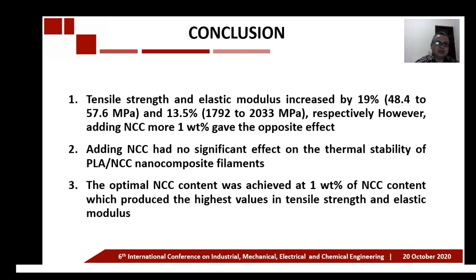The second conclusion is that adding NCC had no significant effect on the thermal stability of the PLA NCC nanocomposite filament. And the last conclusion, the optimal NCC content was achieved at 1% NCC content, which produces the highest values in tensile strength and elastic modulus.